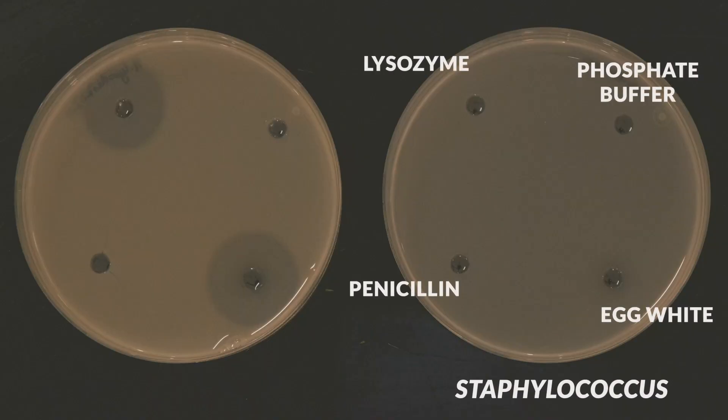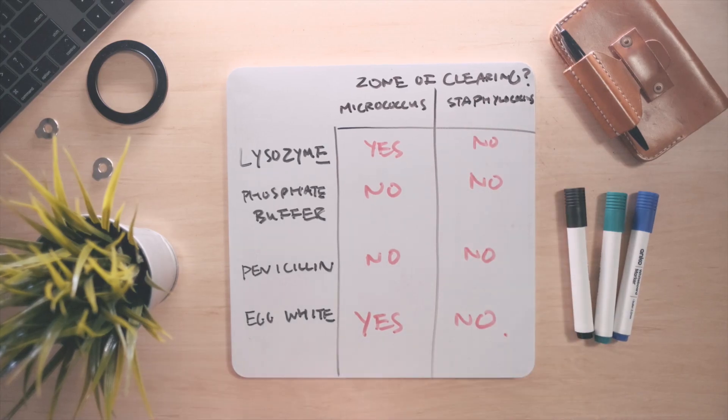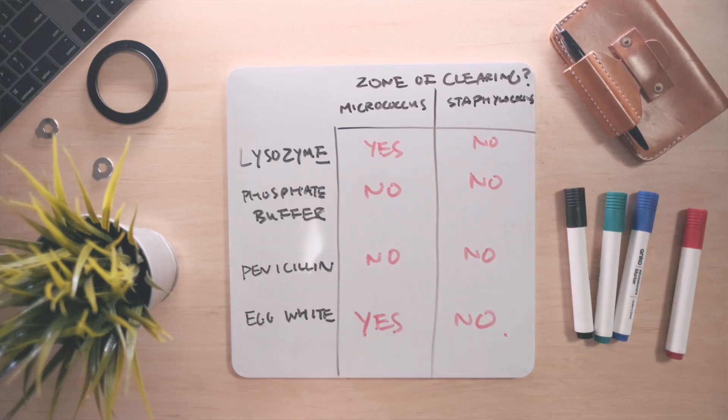But what about Staphylococcus? No zones of clearance are observed in any of the wells. This is due to the fact that Staphylococcus is resistant to lysozyme due to a modification of its peptidoglycan structure.